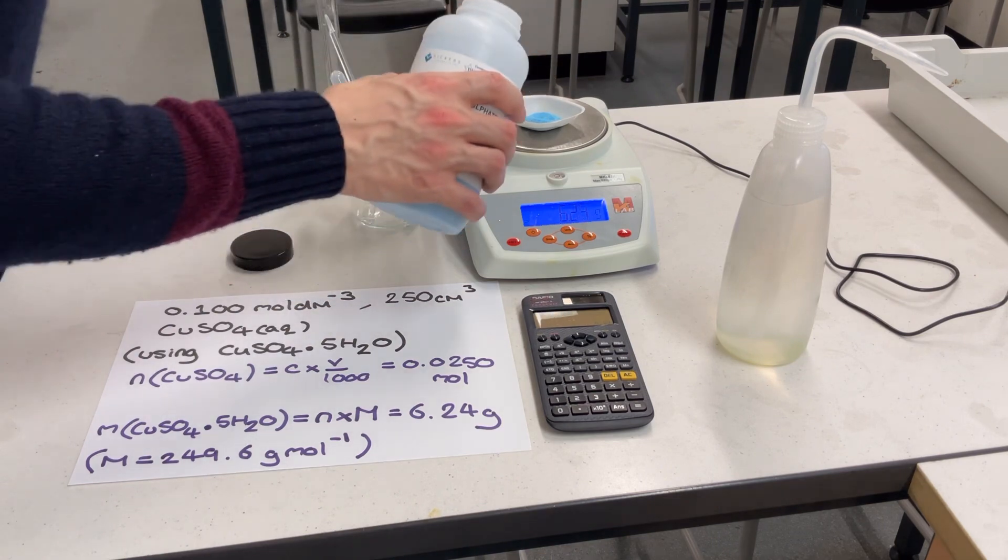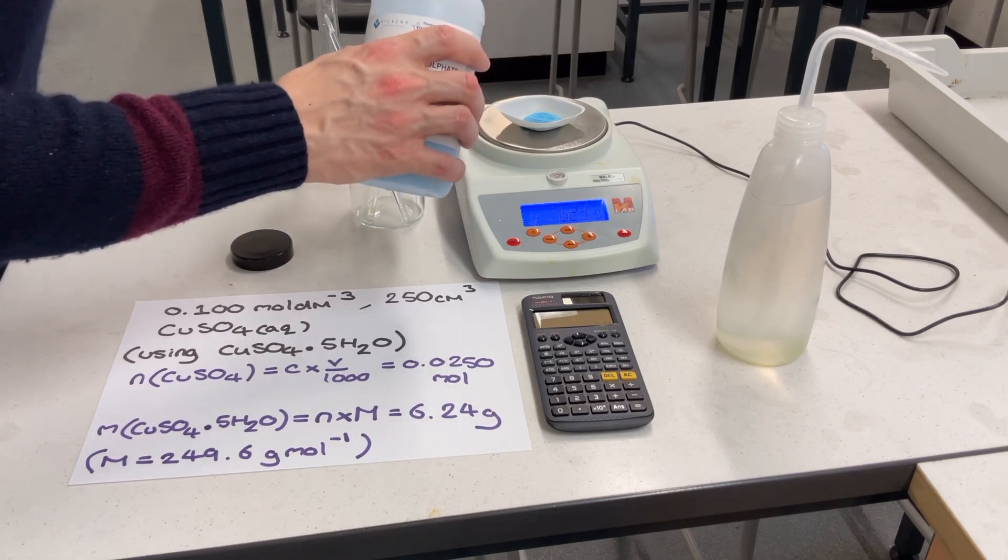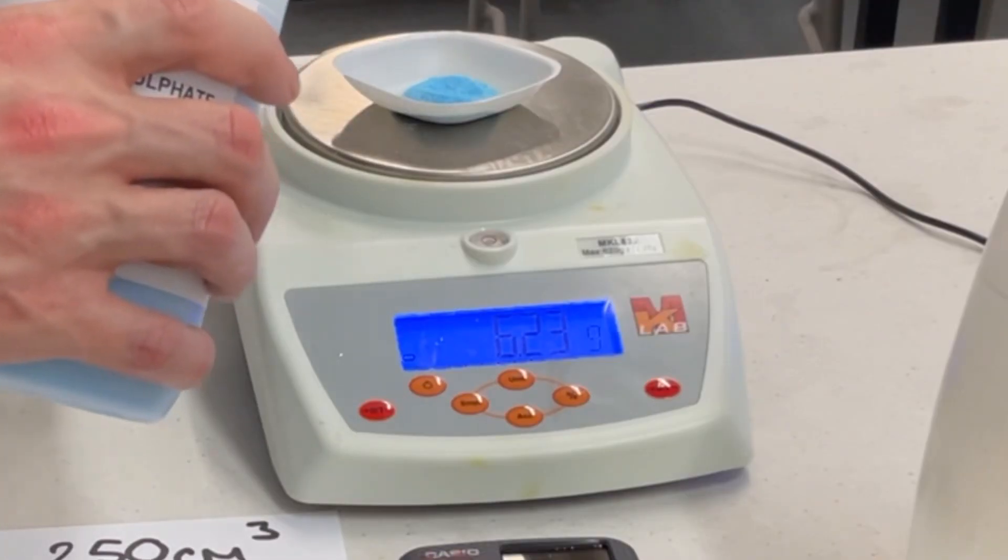Now on to the full procedure. Step 1: Record the mass of the solid to two decimal places using a balance.